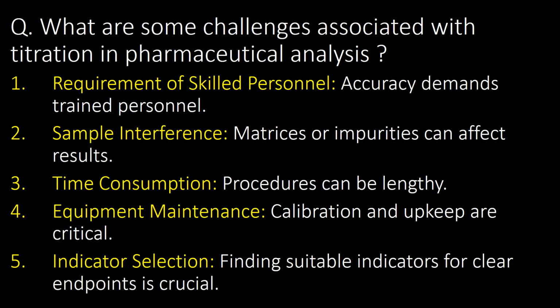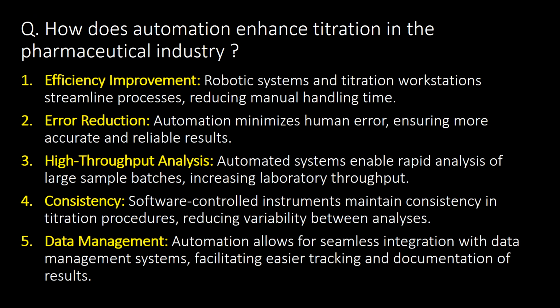What are some challenges associated with titration in pharmaceutical analysis? Some commonly faced challenges are: first, requirement of skilled personnel; second, sample interference; third, time consumption; fourth, equipment maintenance; and fifth, indicator selection. How does automation enhance titration in the pharmaceutical industry? Automation provides efficiency improvement, error reduction, it gives high throughput analysis, provides consistency and data management.